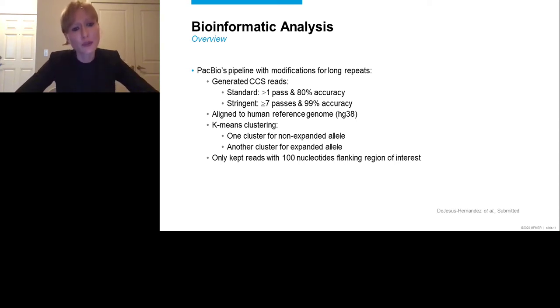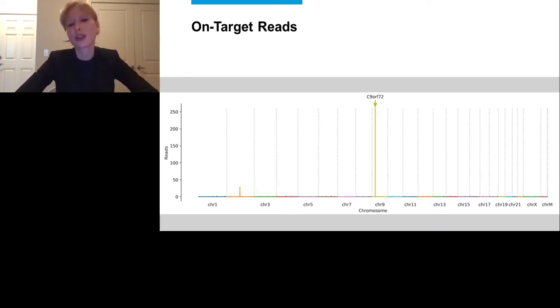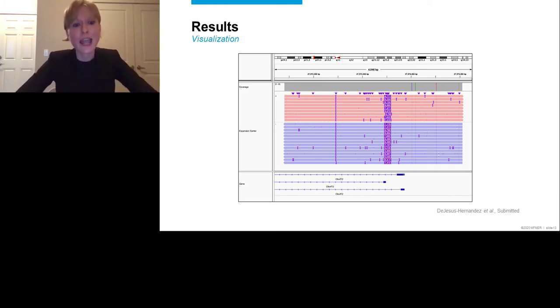And here you can see an example of one individual. And for this individual, more than 250 CCS reads were obtained. And as you can see, there is a nice peak that refers to the C9ORF72 locus. So we have on-target reads as expected. We've also visualized it in IGV, as you can see on this slide, with forward reads, reverse reads, and then an insertion shown in purple. And the number of nucleotides is specified in white. I know that it's difficult to see, but what's more important is that this figure also specifies the region. And it's the region we're interested in. It's indeed the C9ORF72 gene. And the insertion, the C9ORF72 expansion itself, is indeed present in either the first intron or the promoter region, as where it should be, basically.